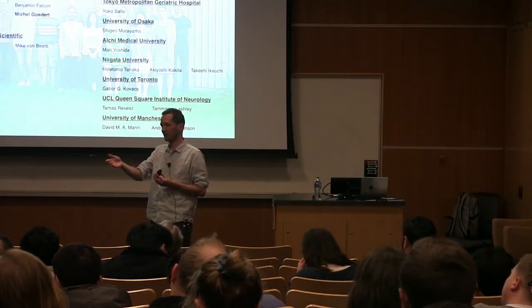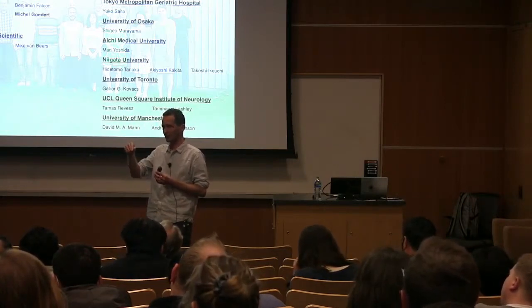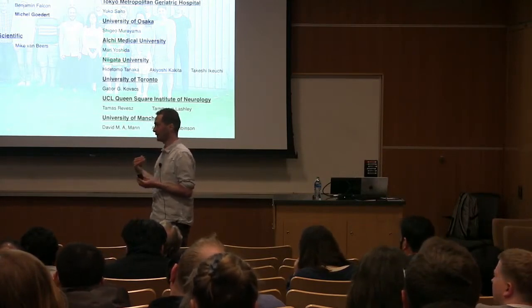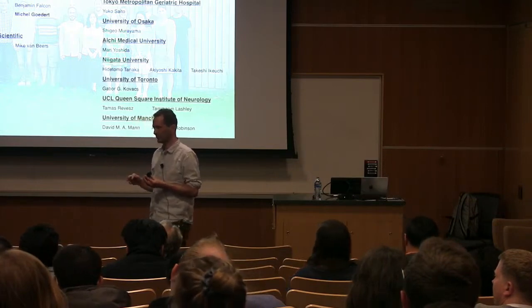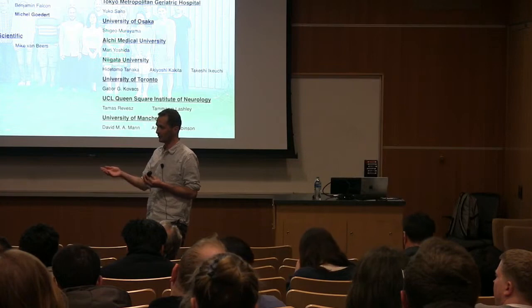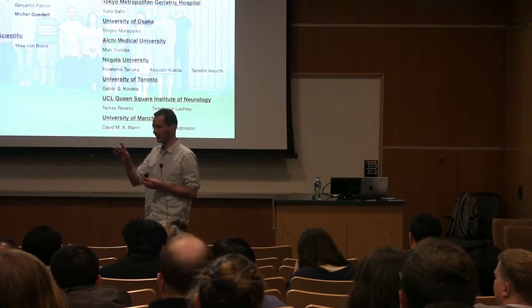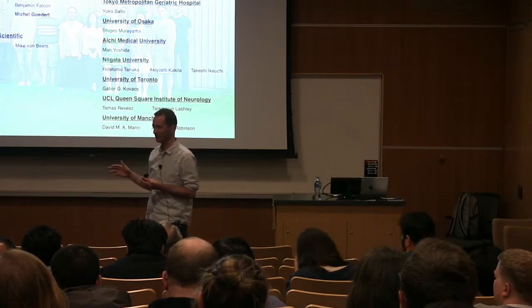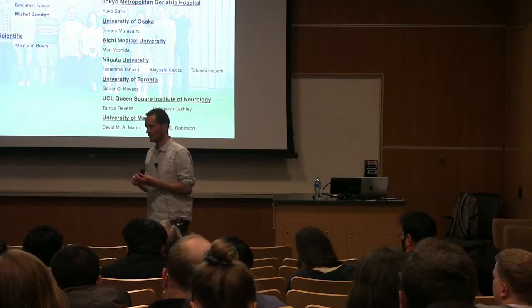But Michel's P301S mouse, we have now determined the structure of. We haven't published it yet, we're writing it up, but the structure is again different from any of the other diseases. We don't have human P301S brains, because I don't think any are available anymore, but we do now have P301L and P301T brains. That's not published yet either, but they're probably different again from the P301S mouse and from the things we've seen before, although that work is not completely finished yet.